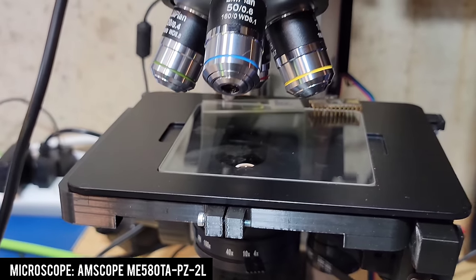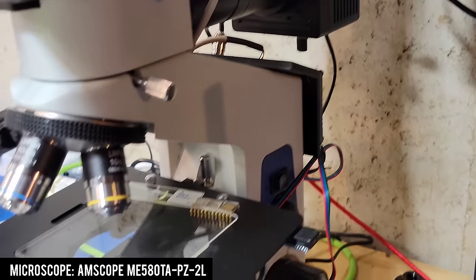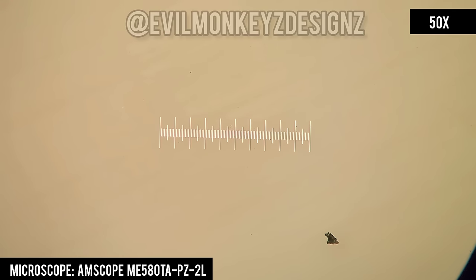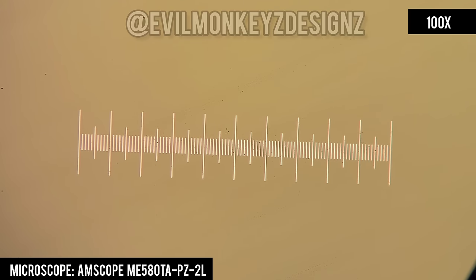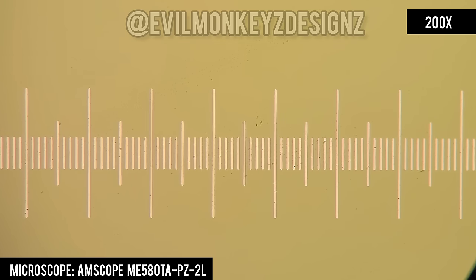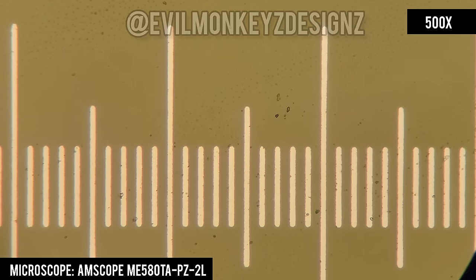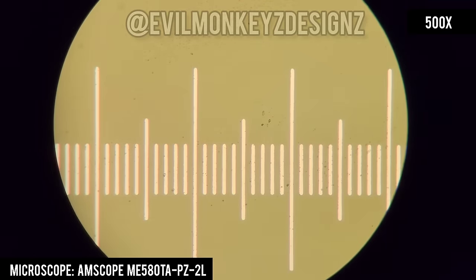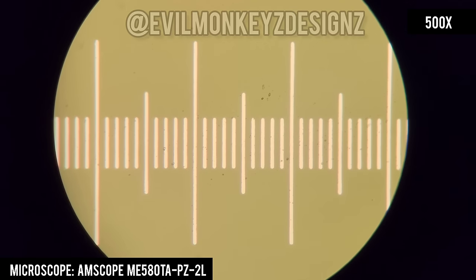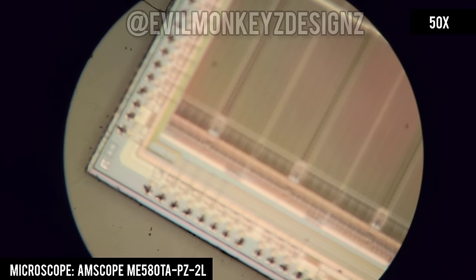The second microscope is the ME580 series from Amscope. The ME580 is a metallurgical microscope with dual illumination, allowing it to illuminate objects from the top or bottom. It also has a wide range of fixed magnifications depending on what optics are used. For this video the maximum magnification is 500 times, accomplished with a 50x objective and a 10x eyepiece. I'll be using these photographs as references for the other digital microscopes. Zooming out a bit you can see there are about 36 divisions at this magnification, and since all the other digital microscopes claim greater than 1000 times magnification, we should expect to see half as many or fewer divisions.